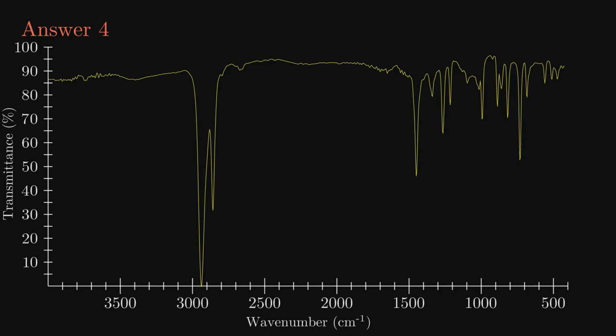This certainly is a different IR, and perhaps easier to read because of how little sticks out. Anyway, we definitely find our good friends the hydrogens on sp3 carbons. And about the only other thing we see here is the other peak indicating there are sp3 carbons, but curiously it's missing the peak for CH3.